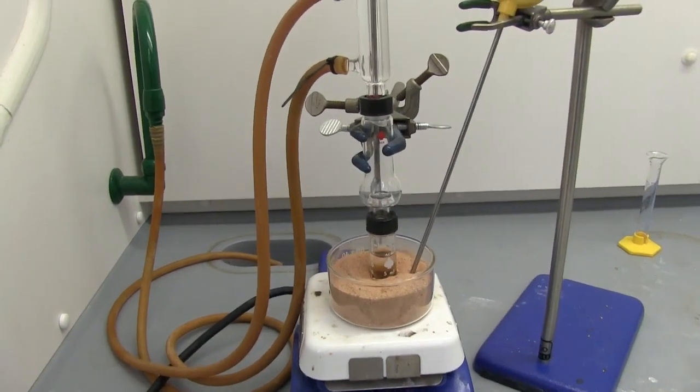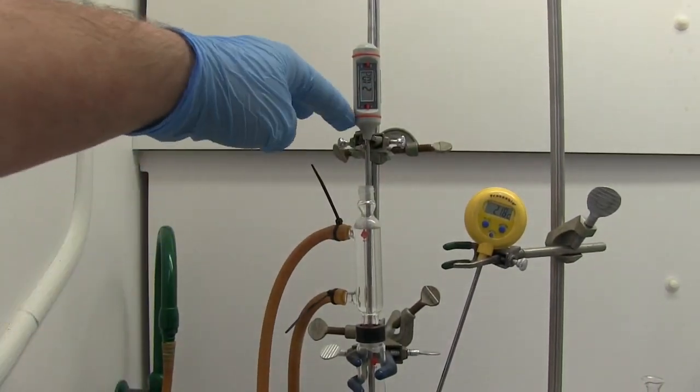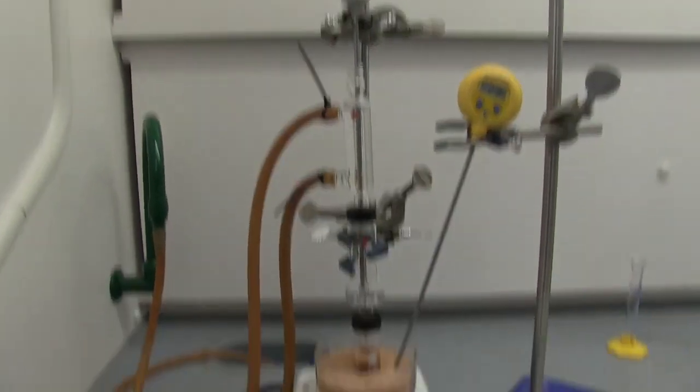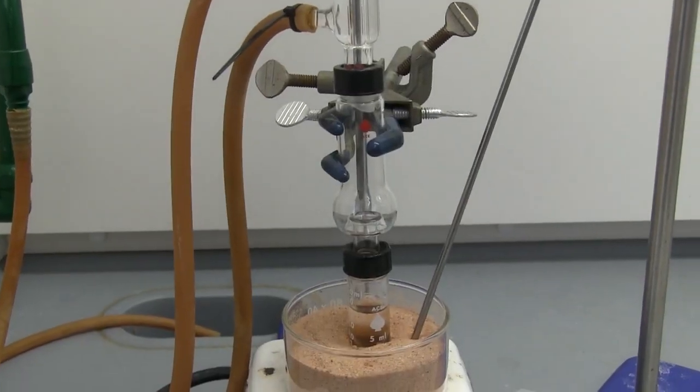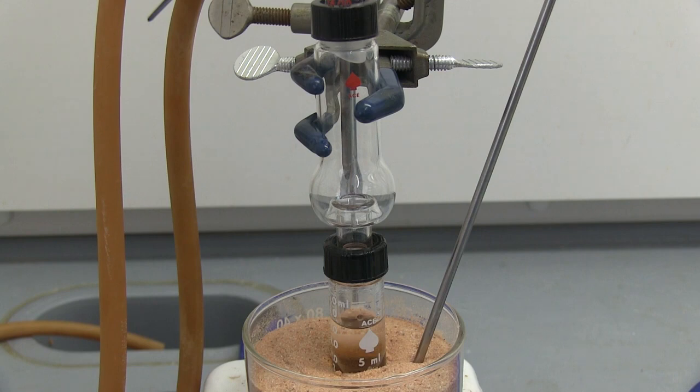Just to show you the setup, we have our thermometer using a clamp just to hold it at the right level, and now we are going to do the distillation. I've turned the heating on, we're going to keep the temperature of the sand around 90 to 110 in between there. And we want to collect the distillate that happens when it's 30 to 45 degrees Celsius.